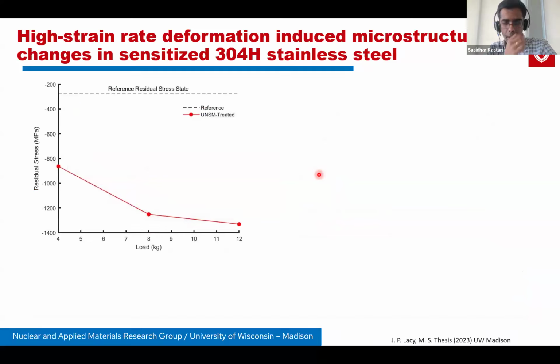In addition, we also measured residual stresses in the material by X-ray diffraction methods. And you can see that there is a compressive residual stress denoted by the negative sign. And the compressive residual stress, the magnitude increases with increasing load.